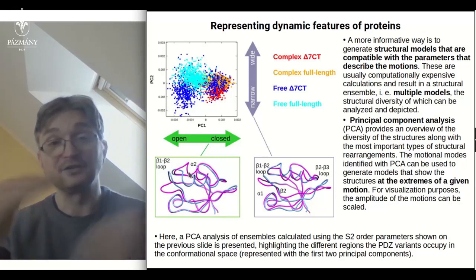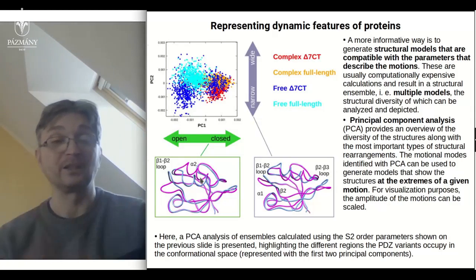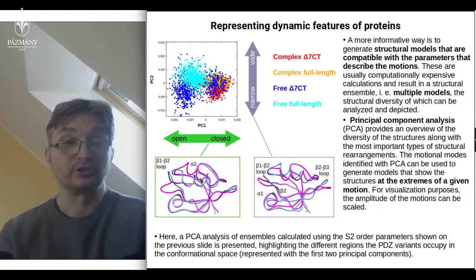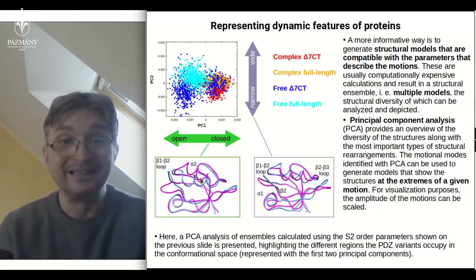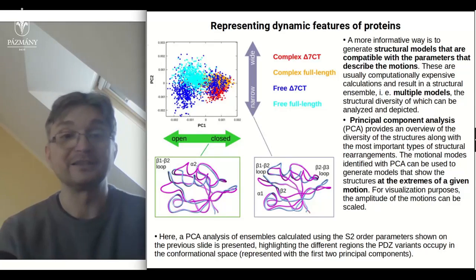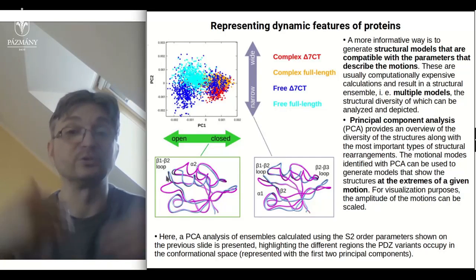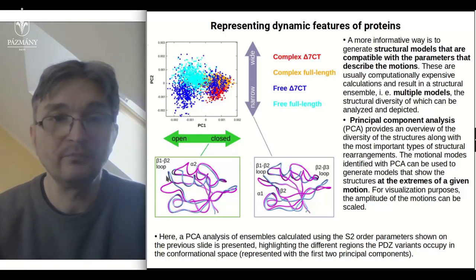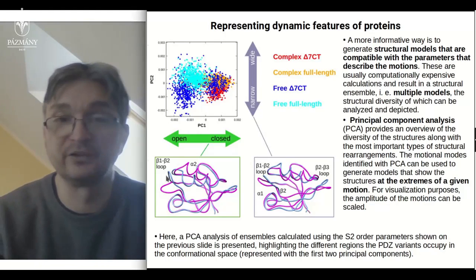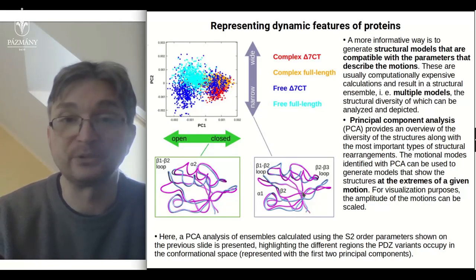the extent of these motions in these particular depictions can be scaled in order to show the nature of the motions more clearly. So here it does not necessarily mean that actually the motion is like this. It shows us the nature of the motions, what is the main characteristic of the given motion. It is also true for the second principal component here.